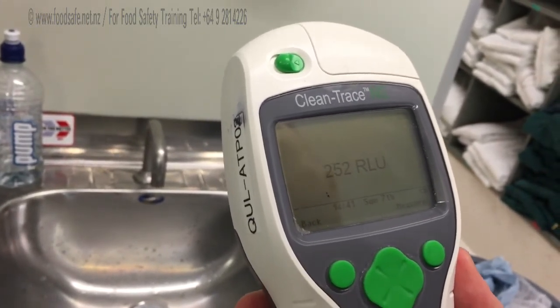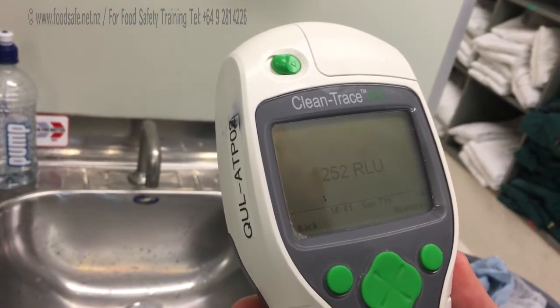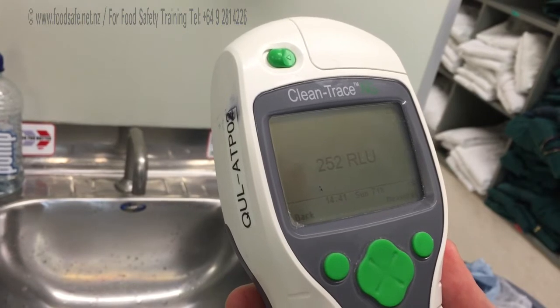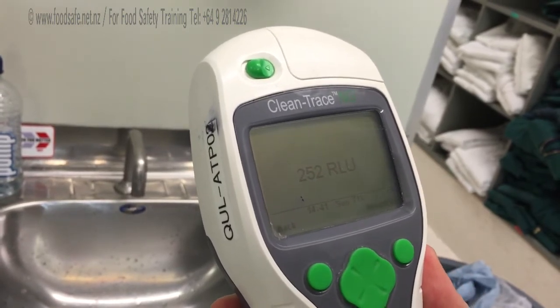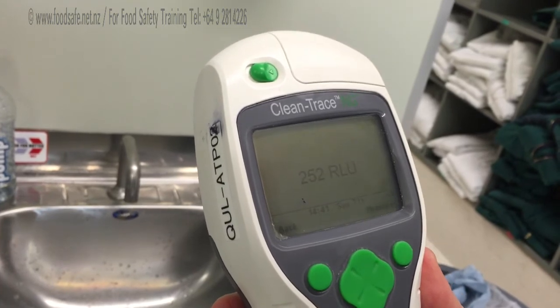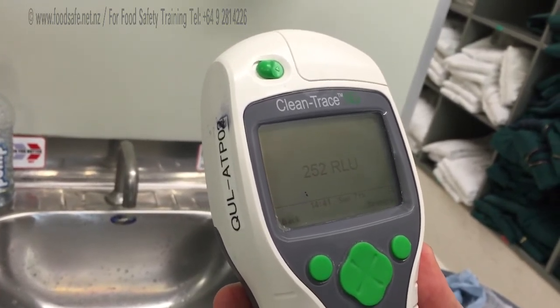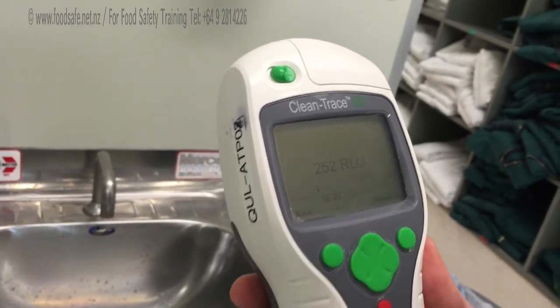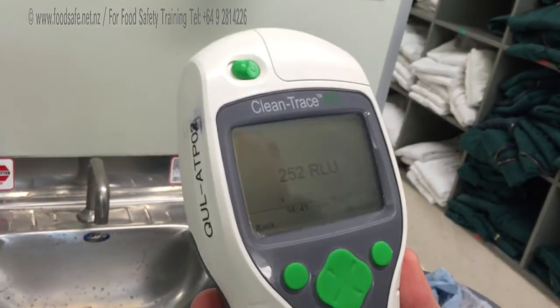So 252. That's under 300 — is that right? Yeah, so that's okay. The range is from — well, this one's calibrated in the hundreds, or they can be in one to five, but this is one to 500. So 252 — anything from 300 and under is okay. That's acceptable, but still reasonably high, just given it's a hand soap area.